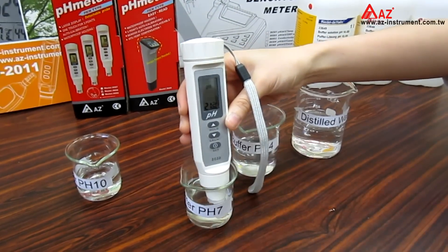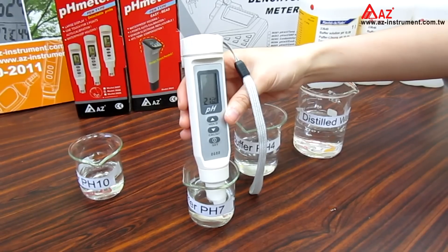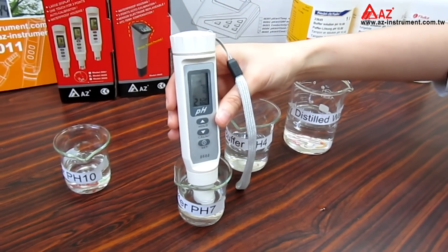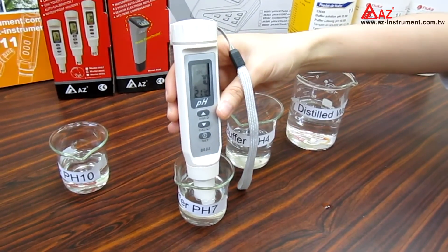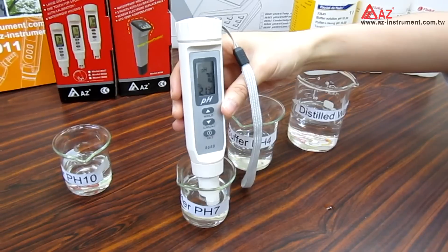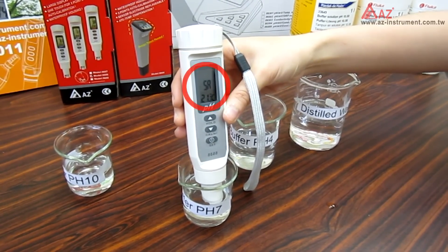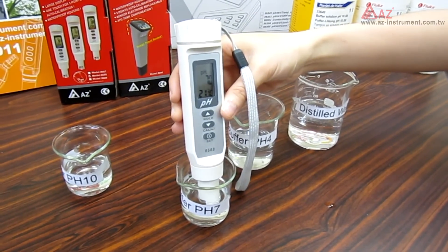You will see the CAL icon and pH reading blink on the LCD. The meter recognizes the buffer in the middle range. Adjust the pH value to match the standard buffer — I'll tune it to 7. Wait for 30 seconds until the reading gets stable.